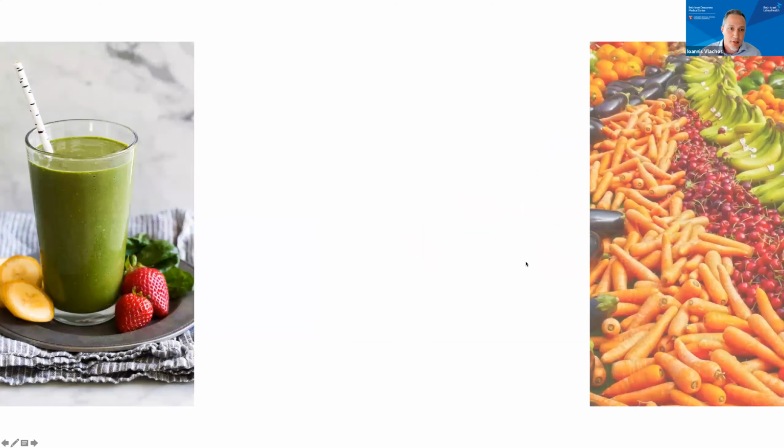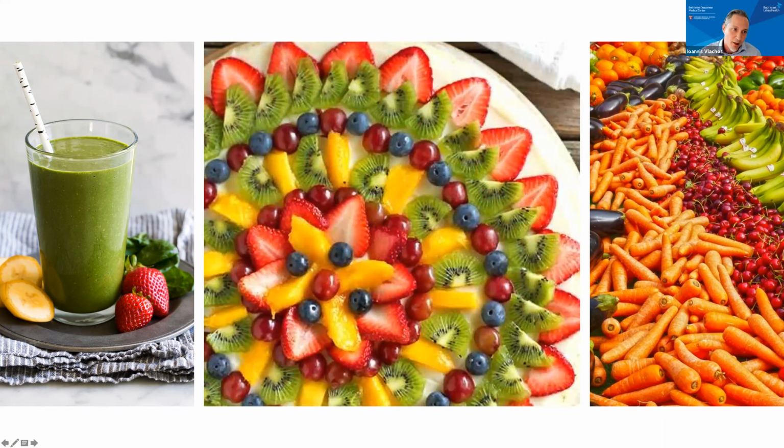And of course, single cell came and provided the opportunity to interrogate independent transcriptomes, or multimodal now with multi-omic information. But you still lack the topology, you still lack the localization, you still lack the in situ information. This is where spatial comes with a promise of bringing everything, but keeping the tissue information there.